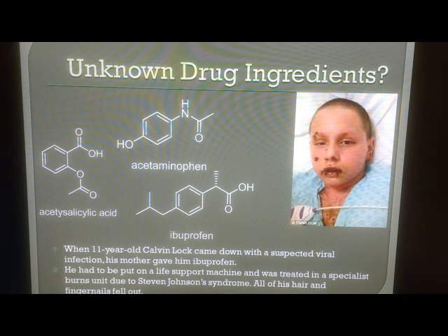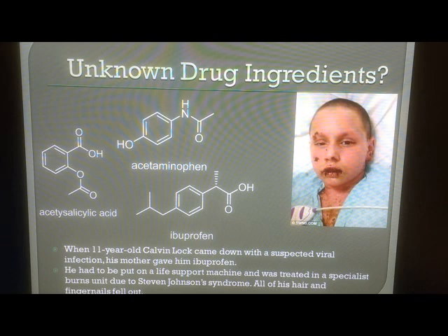So, what's at stake here today is to determine what drug components you have in your unknown drug pill. Now, the components in your unknown drugs could be aspirin or acetylsalicylic acid. That's more of a chemical name; aspirin is more of a commercial name. Or acetaminophen, or ibuprofen, or caffeine. So the ingredients for your unknown painkiller drug can be one of those four things.